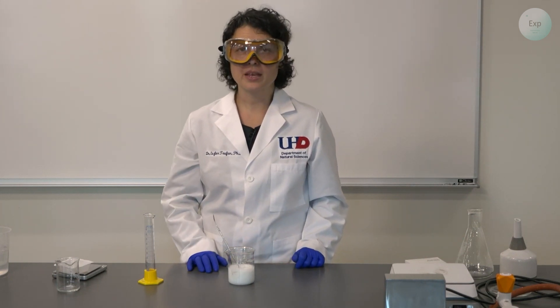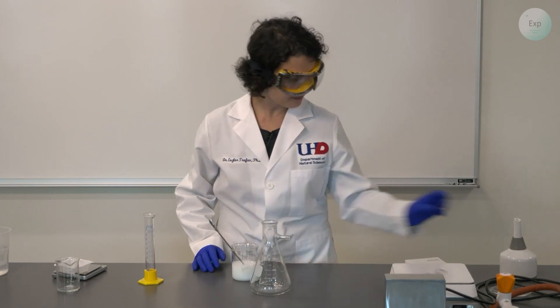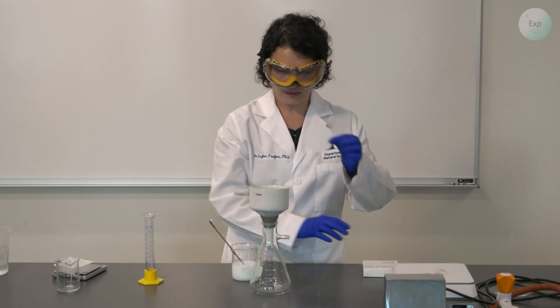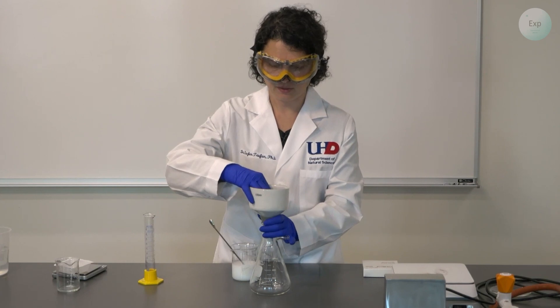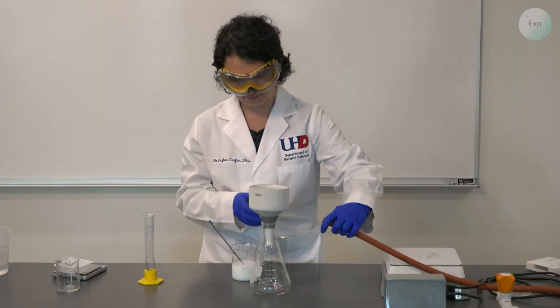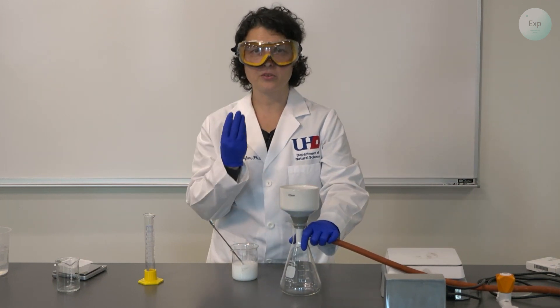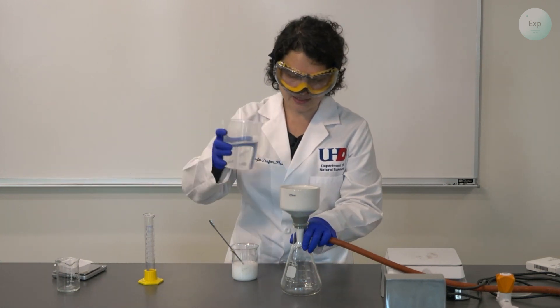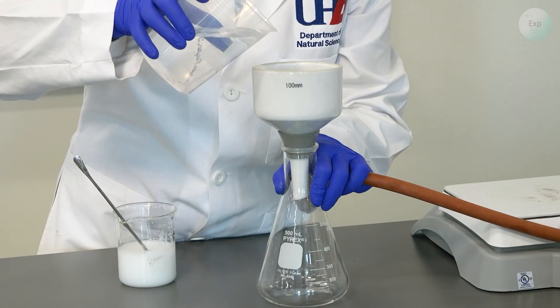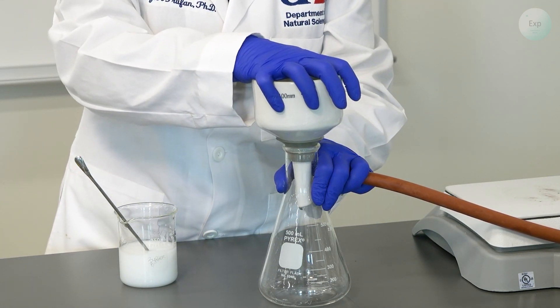We can let it settle for a little bit or we can move to the filtration right away. To set up for the vacuum filtration I will need my vacuum flask, the Buchner funnel with the connecting piece, a clean filter paper that covers all the holes, and then I will need to connect to the vacuum line through a rubber hose. When making the connection, I want to make sure that the paper is stuck to the funnel, so I will use a small amount of deionized water to get that tight seal. If we hear some funny noises, we just need to push down a little bit more.